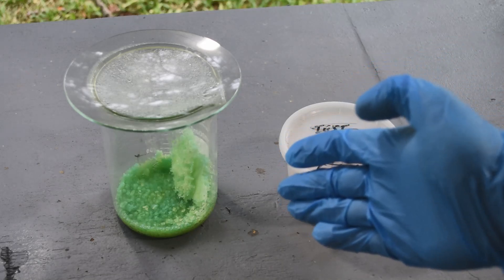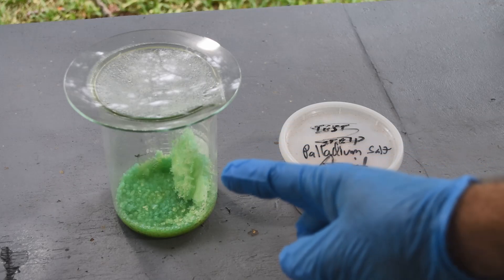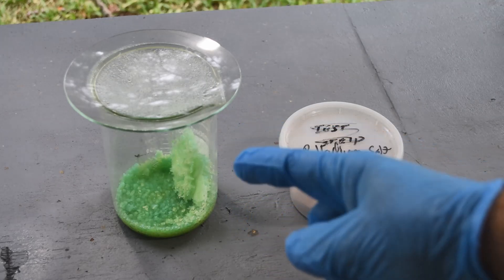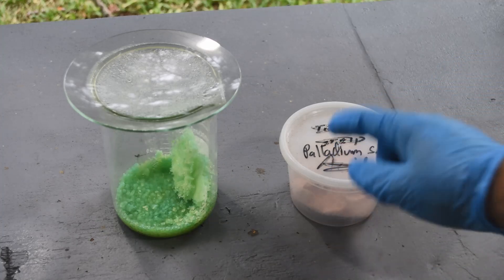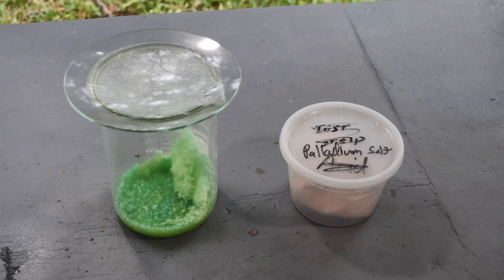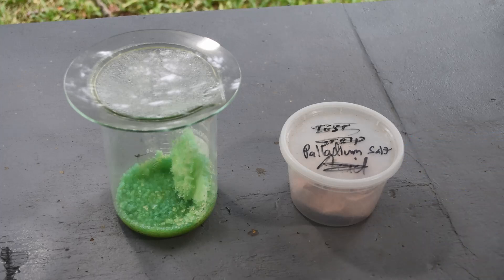If I can extract a significant amount more palladium from this, maybe I'll have enough to bother trying to reduce it to metal. So in this video I'm going to rehydrate this, give it a stannous chloride test, and see if it's still got a fair amount. I'm still waiting on feedback from you guys about whether you want to see me try to reduce this stuff even though I don't think I have that much. Hopefully by then we'll have more palladium hiding in here.